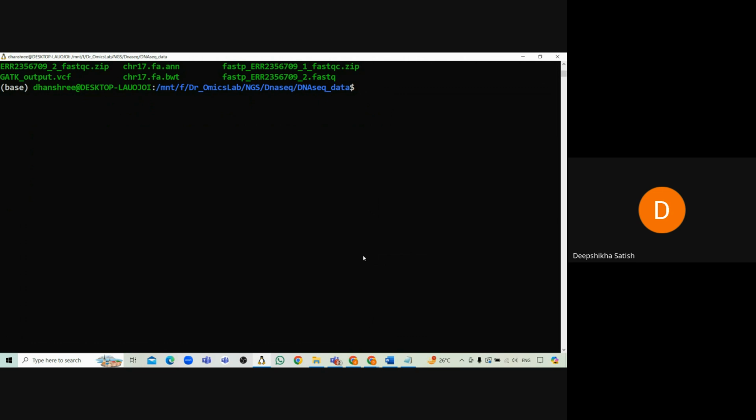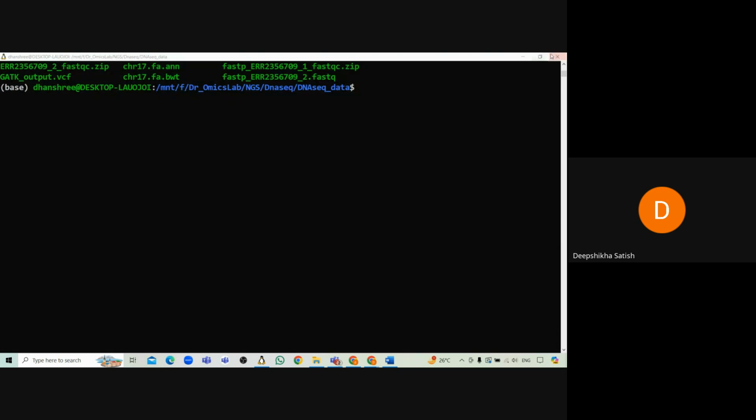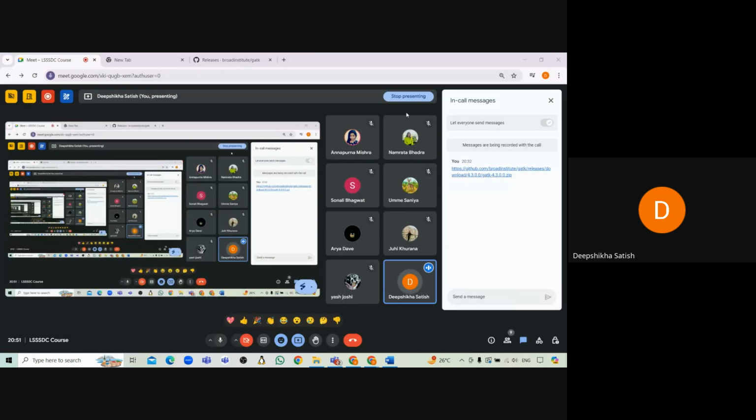Yeah. No, ma'am, I hope everyone's results are generated up to the VCF file. If you have any error or doubt in the command, please tell me.